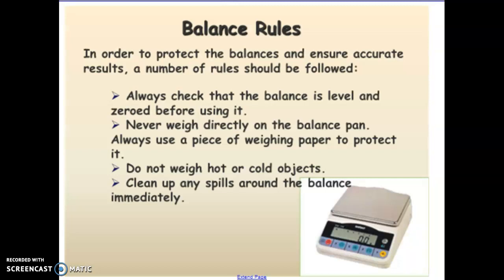Okay, what about when we're using a scale, or a balance? Now, for this one, you're not going to have an estimated number. The scale reading that you would record is whatever the readout is. So some scales will record to 1 decimal point, some scales will record to 2, or some won't even record decimals at all.